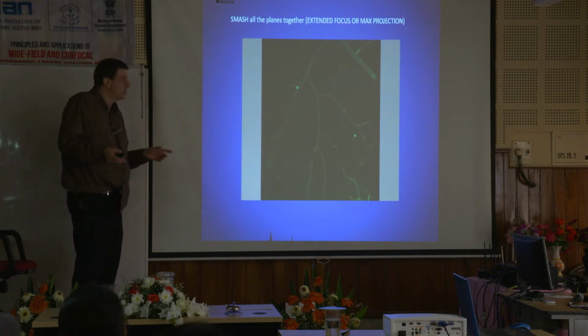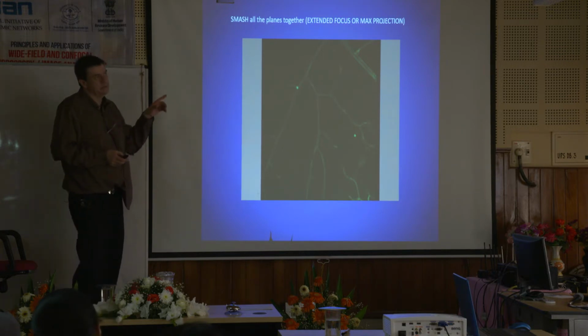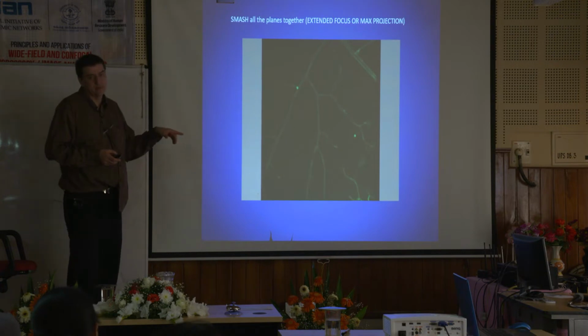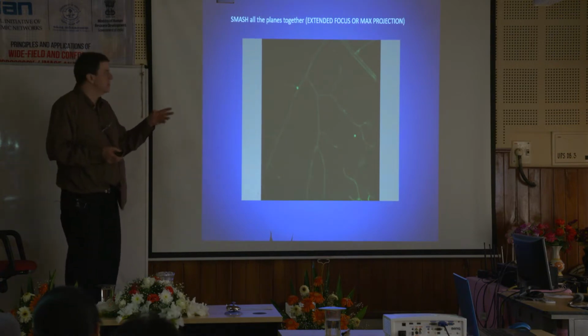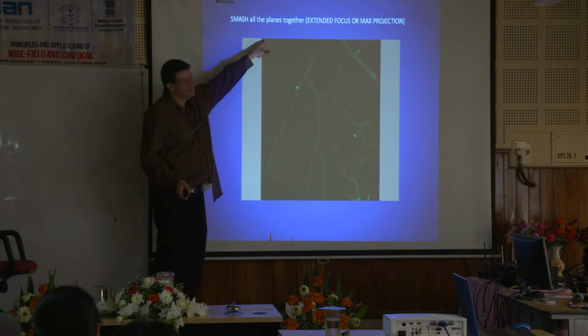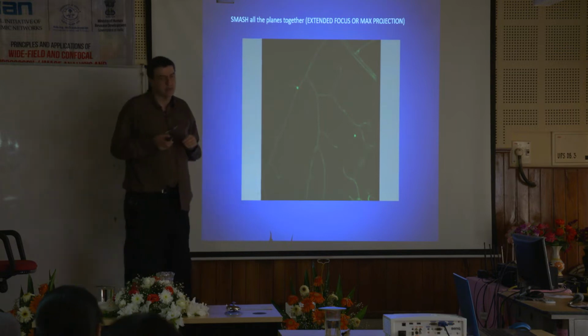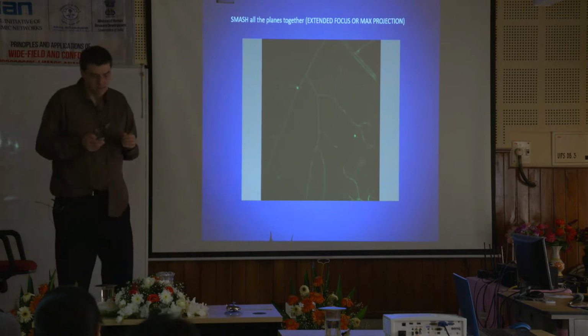So we call this a maximum projection. Other companies will call this extended focus. Those are the two terms they use for this idea. But basically, it goes back to math. Take the pixel, find the brightest. Take the pixel, find the brightest. Go through the deck of cards, find the brightest. Does that make sense?